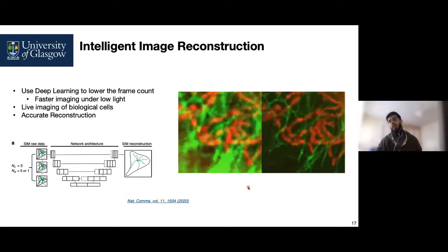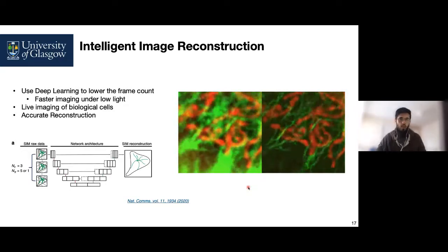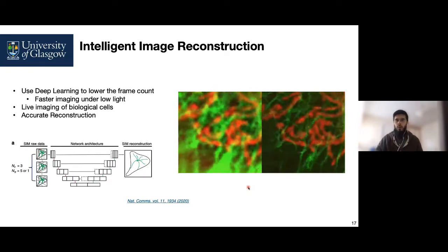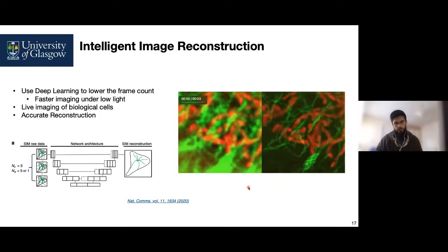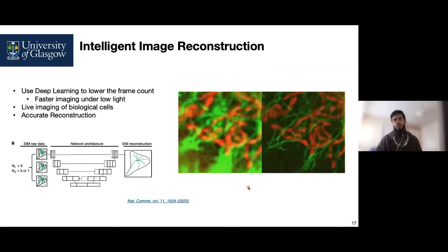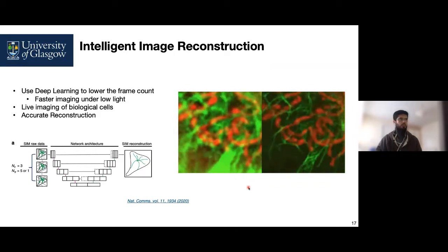One of the biggest attractions of using such intelligent techniques for microscopy is that it would lower the number of exposures that we require in order to construct a sharp image.